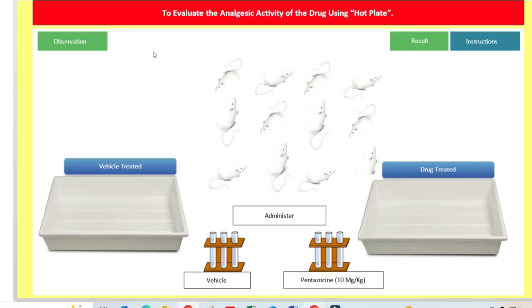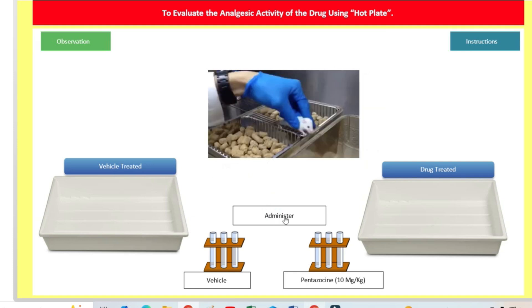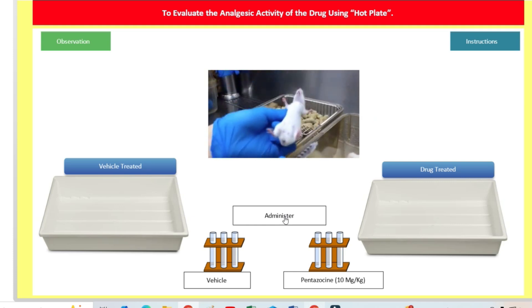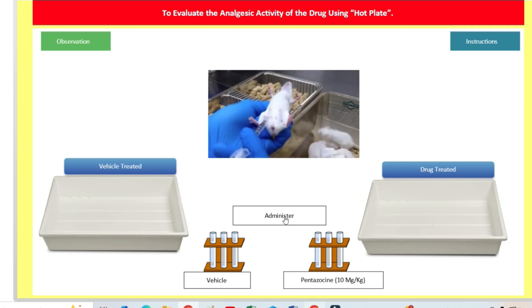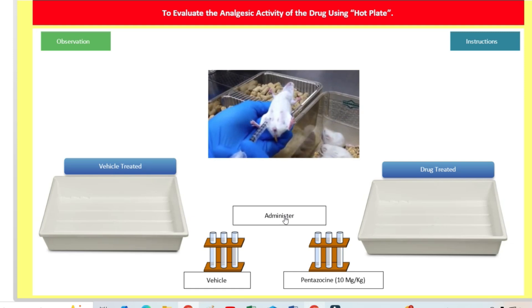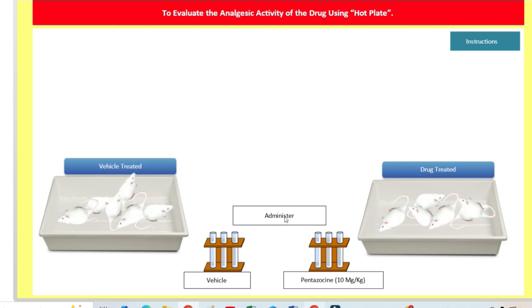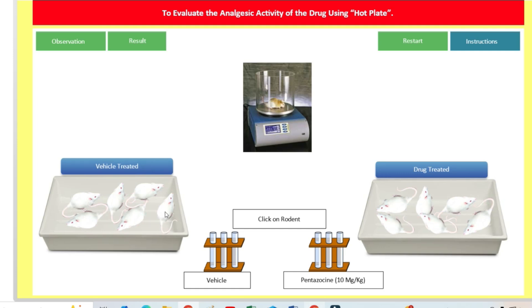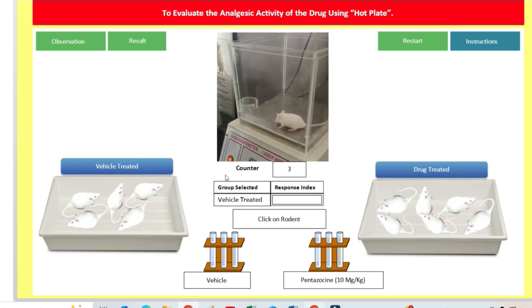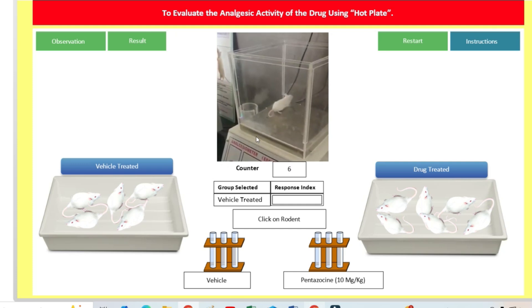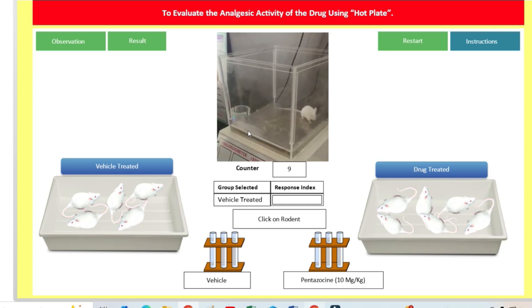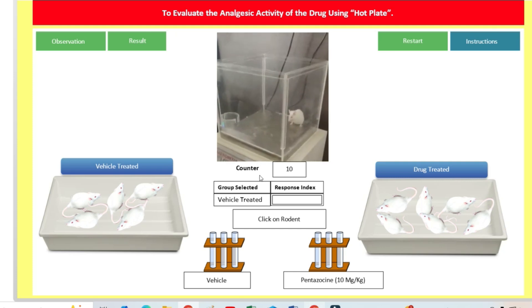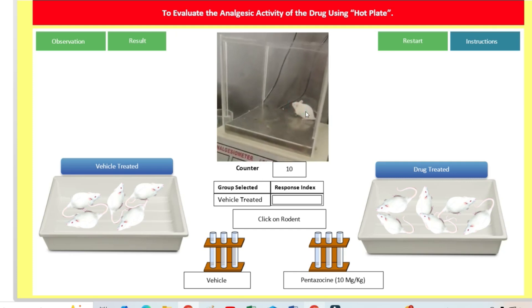Now we will start the experiment. We will administer the drug. You can see we have given the drug by intraperitoneal route to both groups. Now one by one we will evaluate them. We will click on the first animal. It has started — we have put the animal on the plate at 55°C. It is taking around 10 seconds.